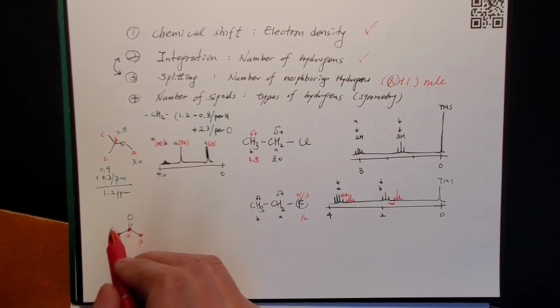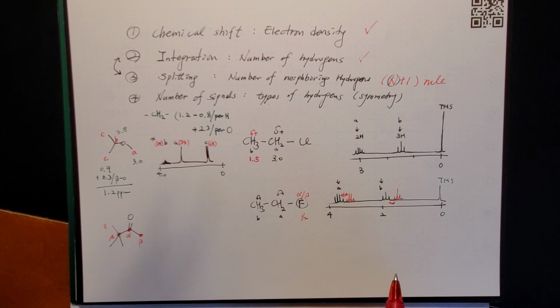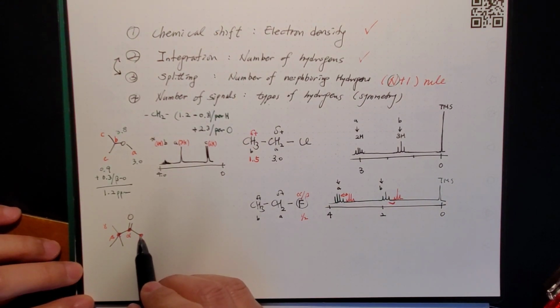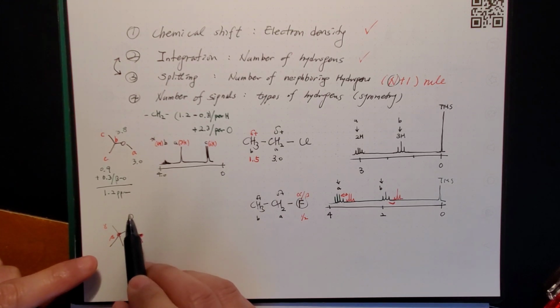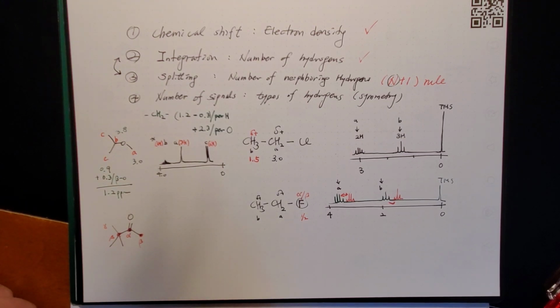Then you have a gamma. Gamma, you can consider that they don't have an influence of the oxygen at all. That's fine, okay, for non-majors. So what do we do? Well, this is the beta. So the value should be half of it, roughly speaking. The alpha with the oxygen could have been what? 3.5-ish, right? So half of it is about 1 point something.